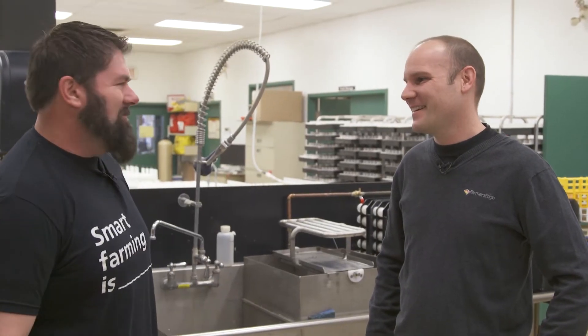We're here on the Smart Farming Is Tour with Patrick Visser. We are in the Canadian Farmers Ed Soil Laboratory — or the Canadian Soil Test Laboratory. It sounds very science-y, like there should be abominations in the back. Not typically, but it is the Canadian Soil Test Laboratory — you can put the emphasis wherever you like on it. All right, well, let's go look at stuff and blow stuff up.